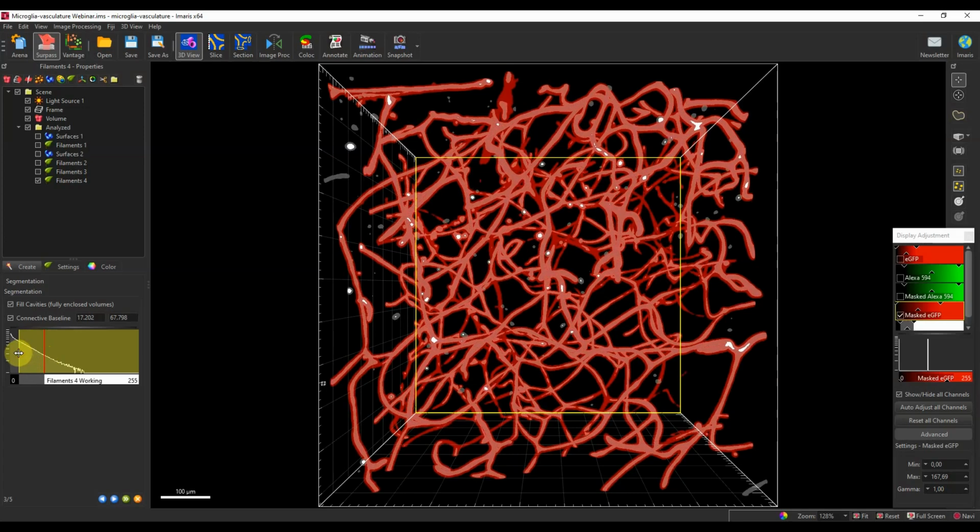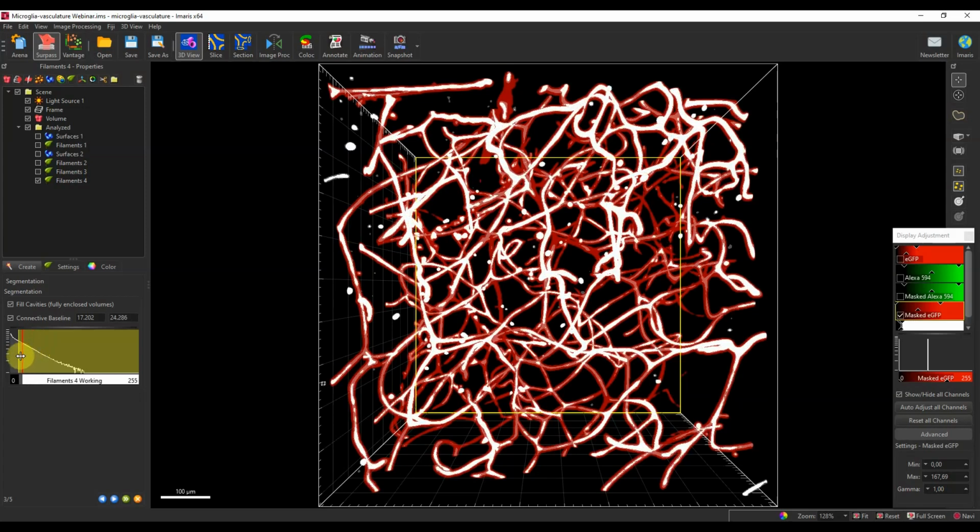Really the idea is that the voxels with intensities below the lower threshold will be considered as background, and the upper threshold would be the minimal intensity value of the object to be included in the filament calculation process. Or in other words, we will get a continuous looping filament structure when the gray areas are connected and also contain some of the white areas. So in any case, making sure that all the signal is being encapsulated by this gray line would be the most important step here.